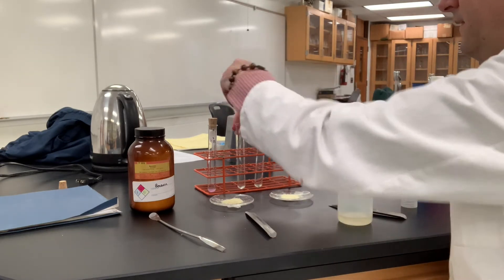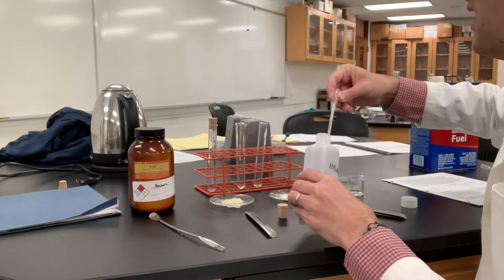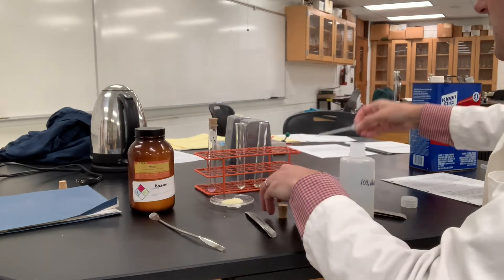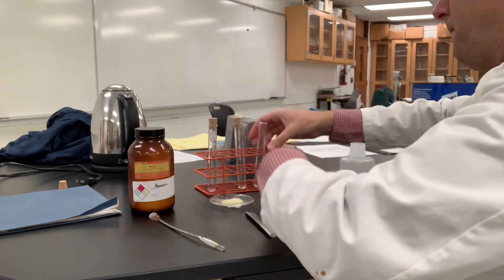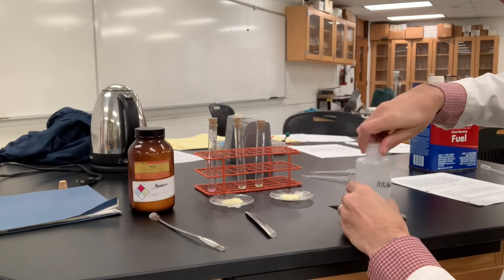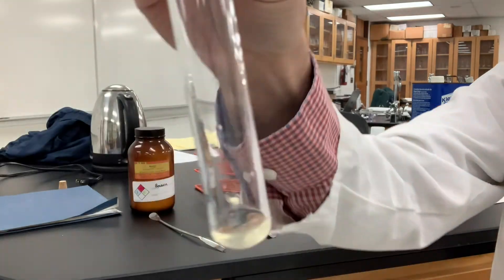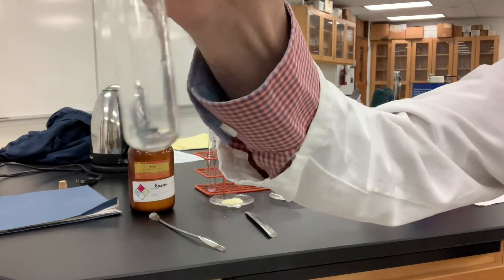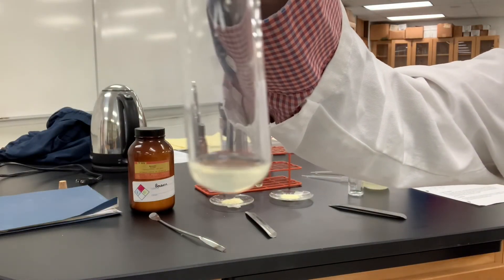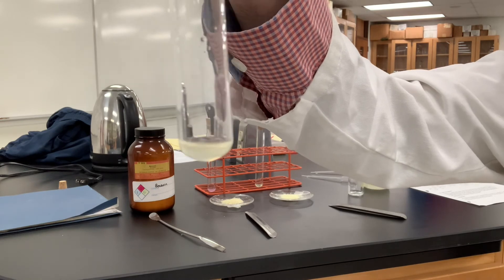So let me add one drop of this 10% sodium hydroxide solution to each of these. Let's shake them up. If I shake this one, you can see the color is fairly light yellow because the benzyl is a light yellow. It did not change. It did not change purple.